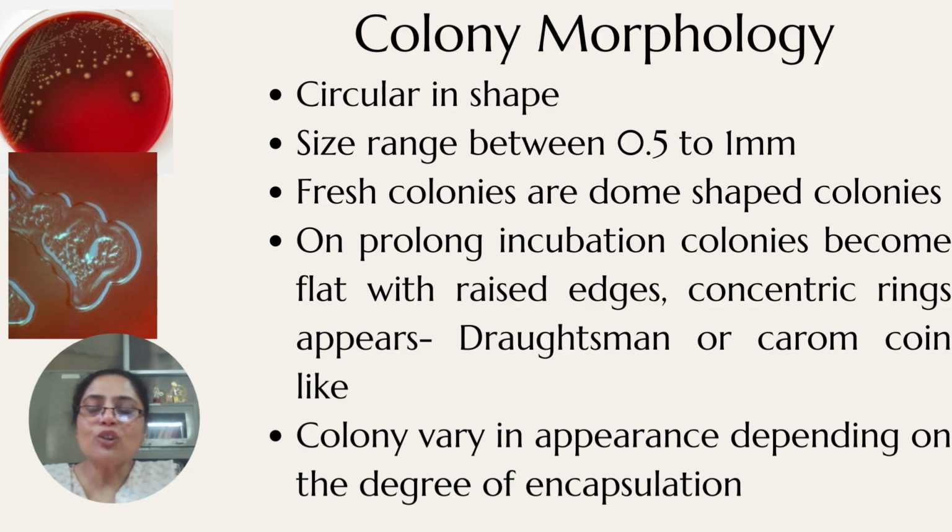Fresh colonies are dome shaped, while on prolonged incubation, colonies become flat with raised edges and having concentric rings. And this kind of colony is also called draftsman or carom coin like colony. And if you see the first picture or the image, yes, I have clicked it.